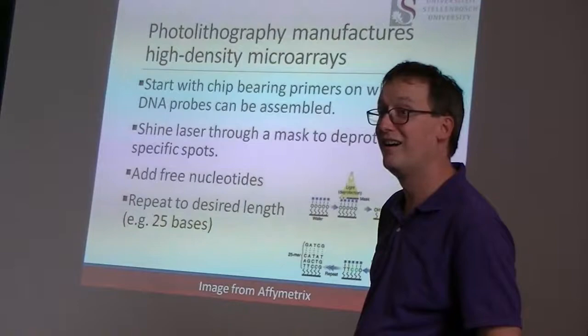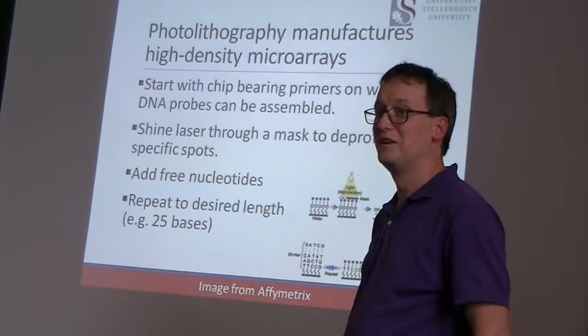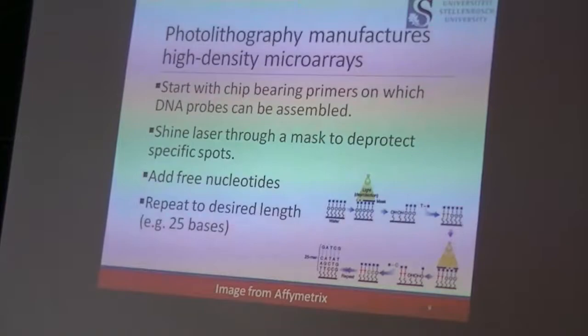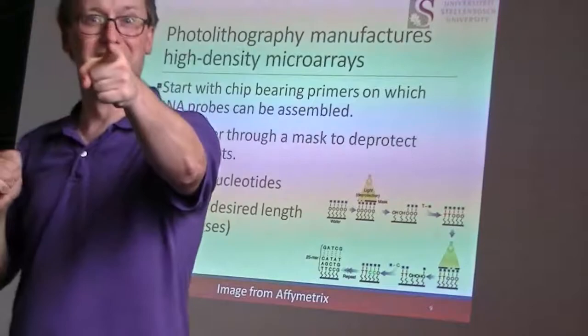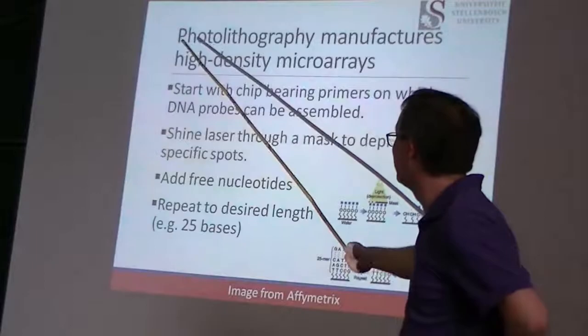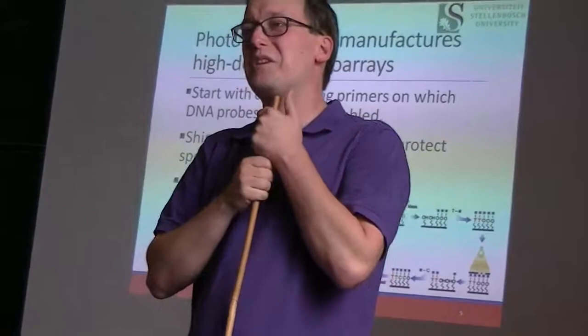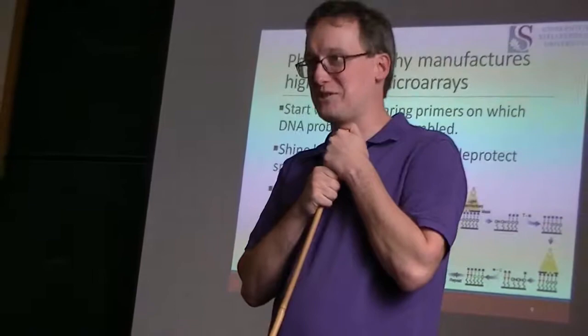It does not have to do with electrons. Litho? Google to the rescue, quickly. Organic? Nope. Rocks. Rocks it is. So we've got light, rocks, and? Yes, light rock writing. We are going to create on a rock substrate via light a DNA strand.